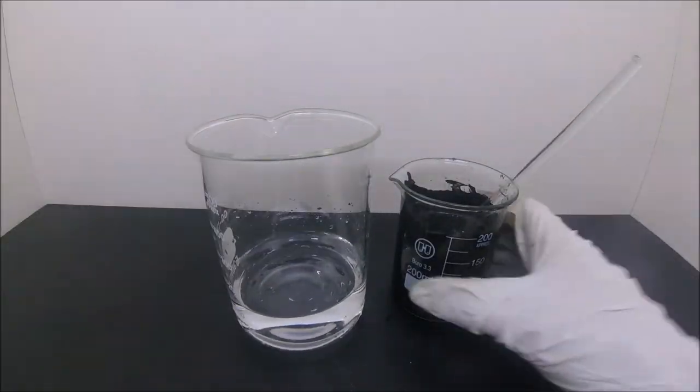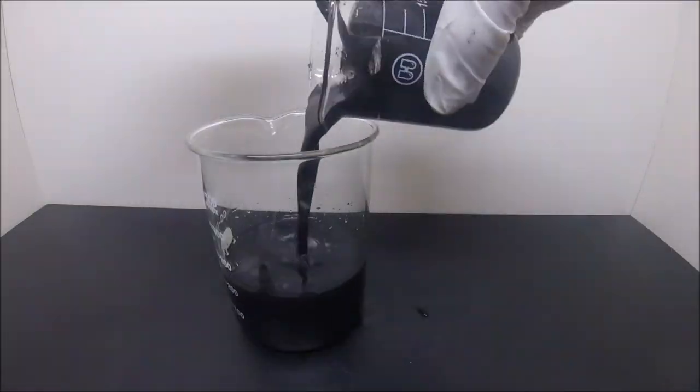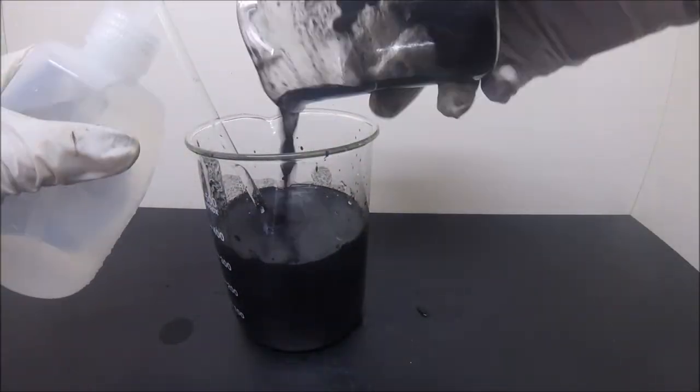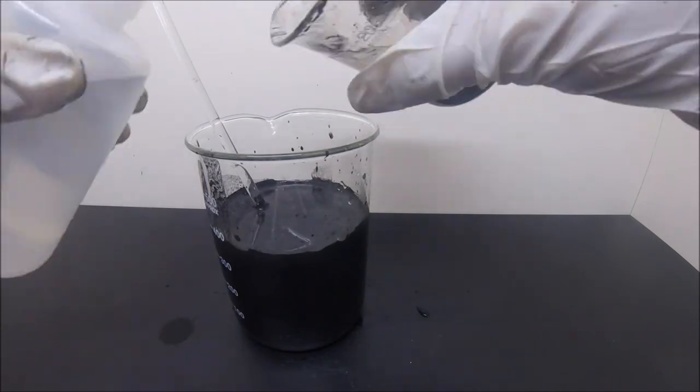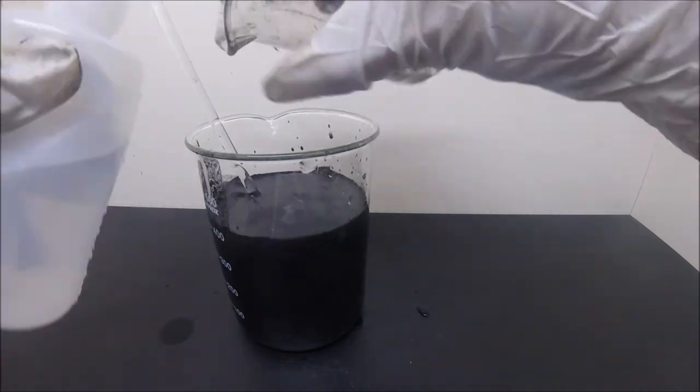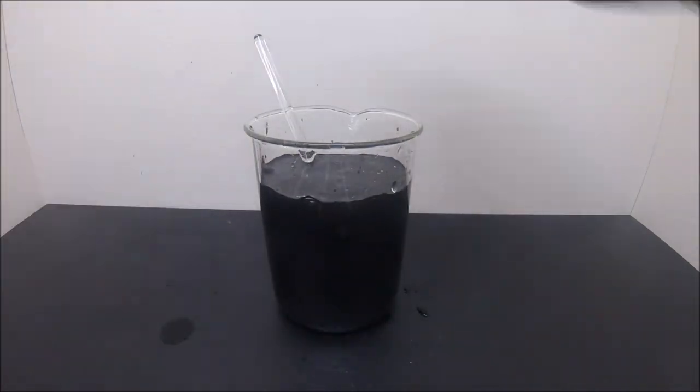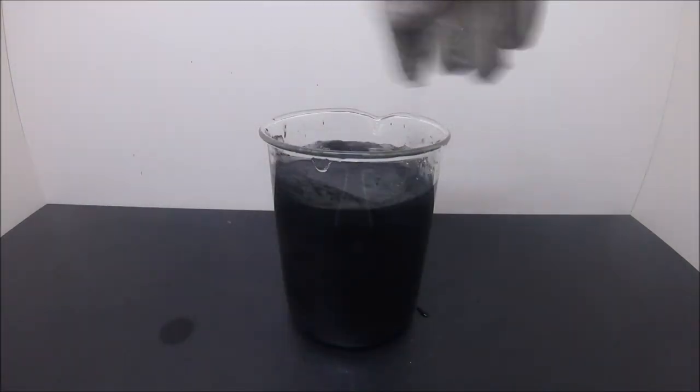Then I realized the beaker was too small for the job, so I had to transfer it into a larger one. And repeat the process I just said.